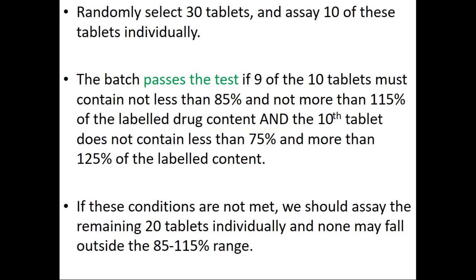How do we know that this batch is acceptable and passes the test? If 9 of the 10 tablets must contain not less than 85% and not more than 115% of the labeled drug content.